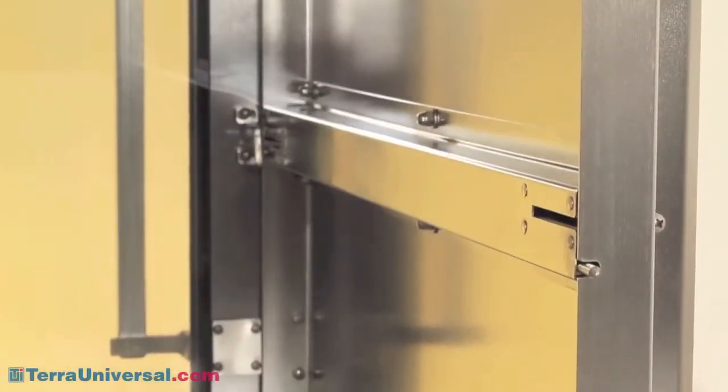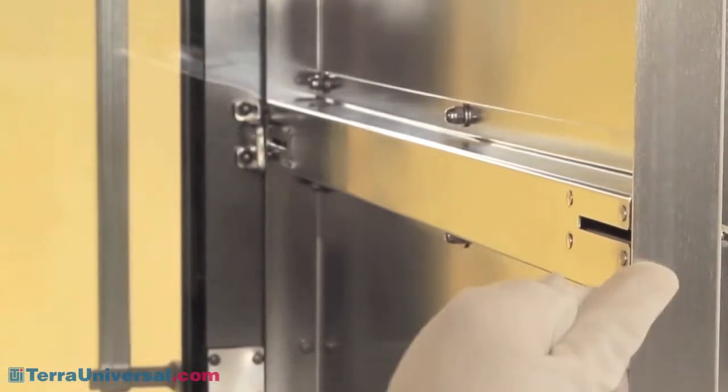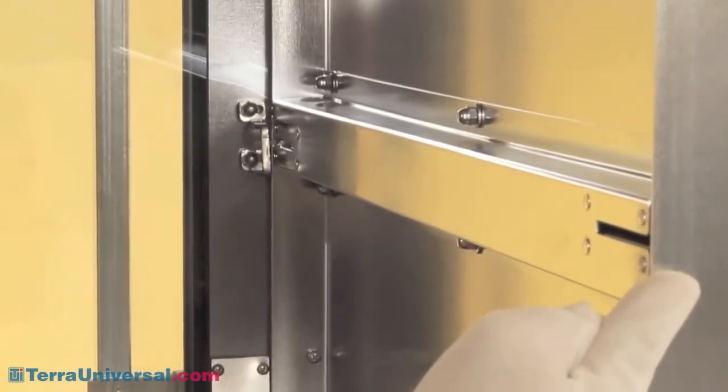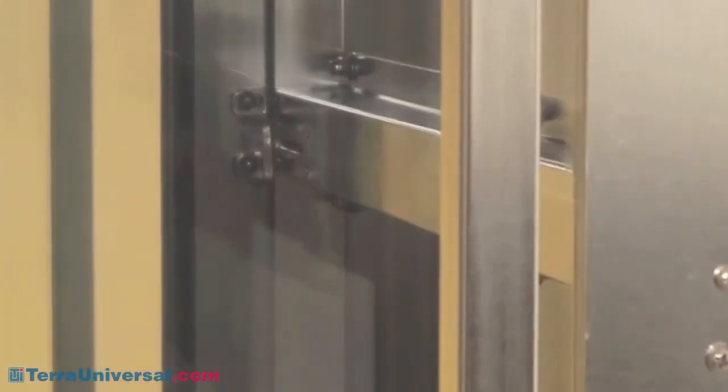Like Terra's other pass-throughs, these models feature interlocked doors that prevent cross-contamination during parts access. The heavy gauge mechanism is rated for millions of operations and resists heavy use and abuse.